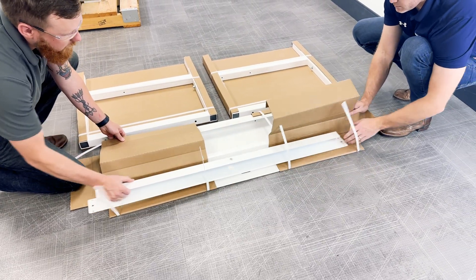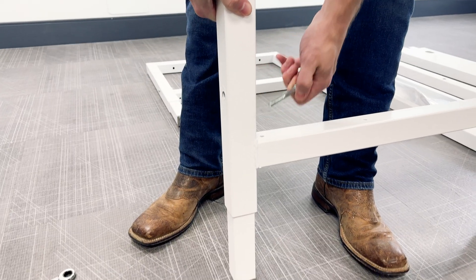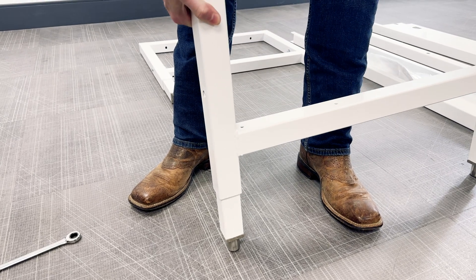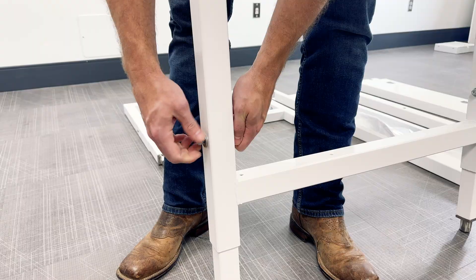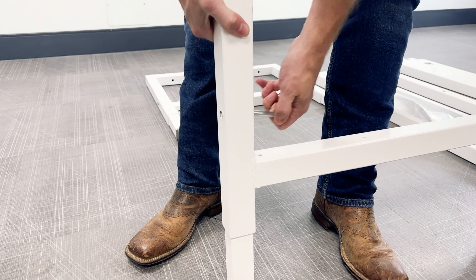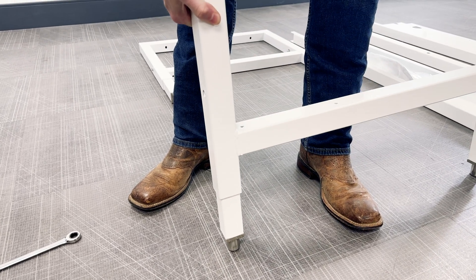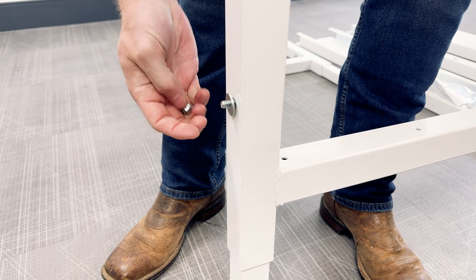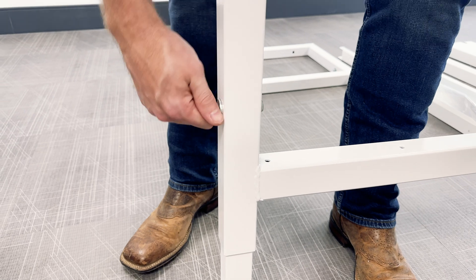Now you can start assembling the base stand. Unpack the base stand components that were set aside earlier. The base stand ships from LabConco at a working height of 30 inches but is adjustable up to 37 inches in 1-inch increments. To adjust the base stand height, loosen and remove the leg bolts and adjust the legs to the desired working height.